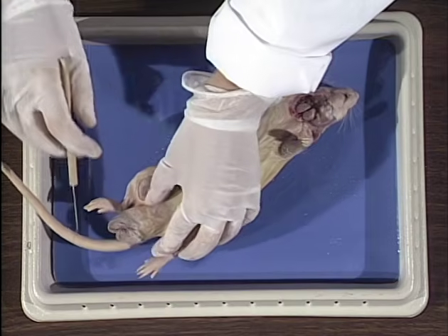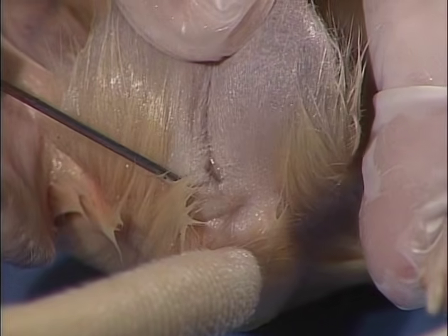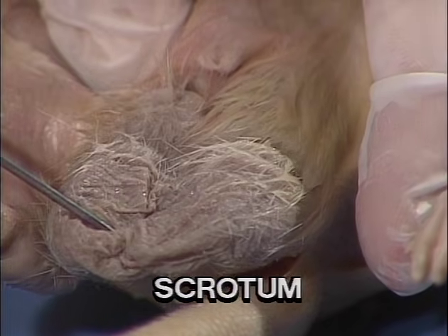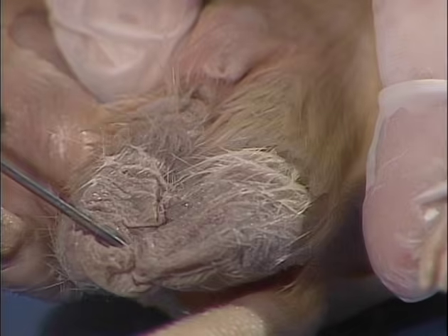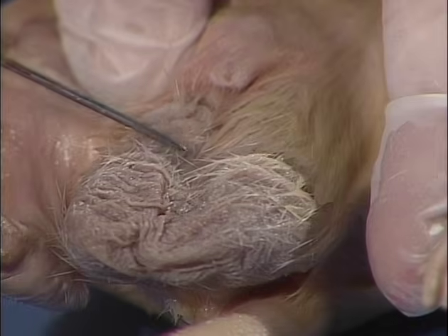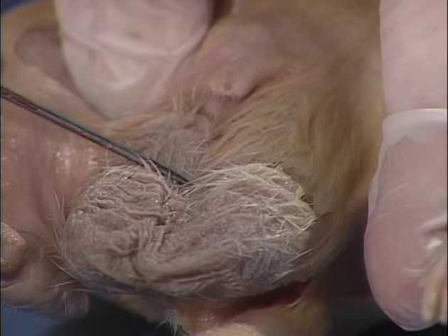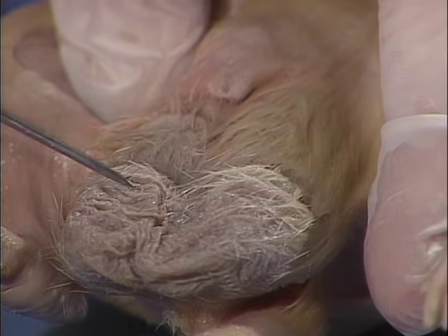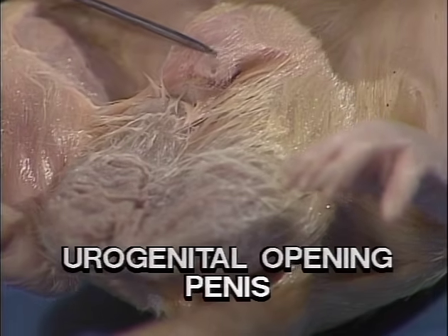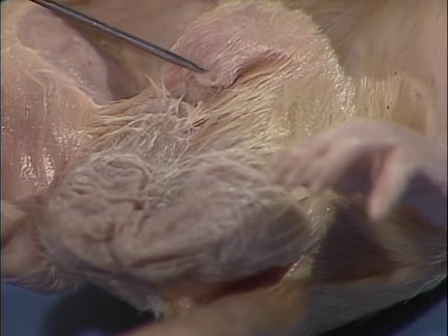In the male, we find two openings. At the base of the tail is the anal opening. It is covered over by the scrotum, which contains the testes during the breeding season. These sacs are unique to warm-blooded mammals. They allow the testes, which are very sensitive to high temperature, to be held outside the mammal's body. The testes descend only during the breeding season. The ascent and descent of the testes are controlled by the cremaster muscles. The urogenital opening is located at the tip of the penis. It releases sperm and urine from the body.